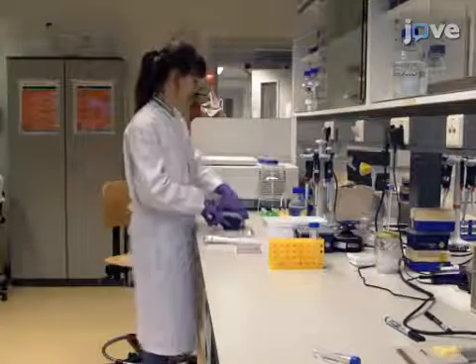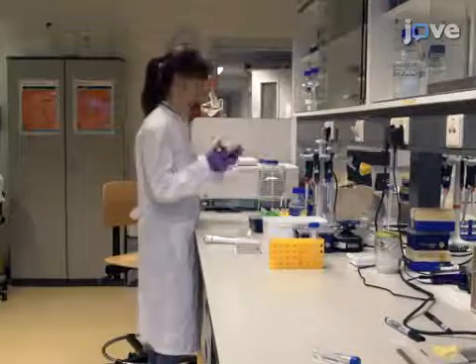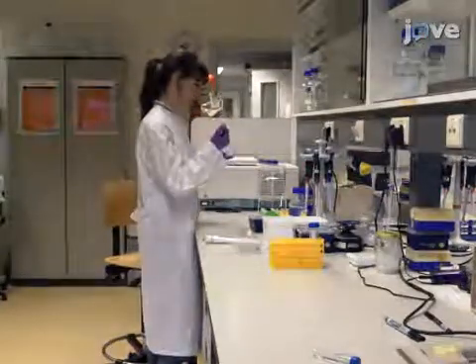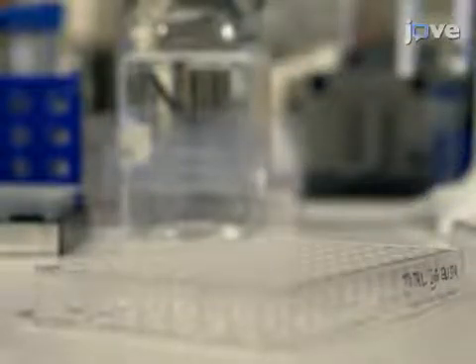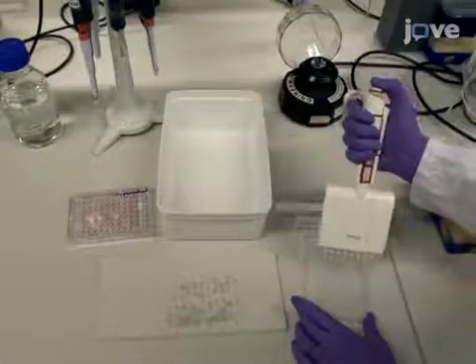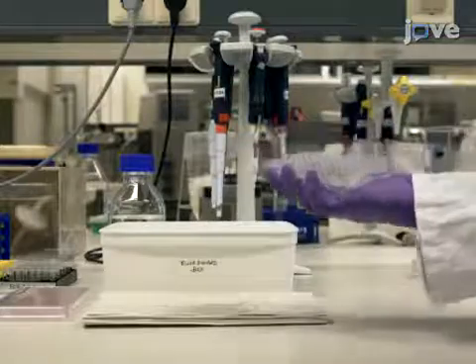Check the supernatant from the medium changes for IgG production using an enzyme-linked immunosorbent assay, or ELISA. First, prepare the ELISA plates. To each well, dispense 50 microliters of goat anti-human Fc antibodies diluted 1 to 200 in coating buffer. After incubating and washing the plate, block the wells with 100 microliters of blocking buffer per well and incubate the plate again. After the block incubation, knock the liquid out of the plate onto a paper towel.